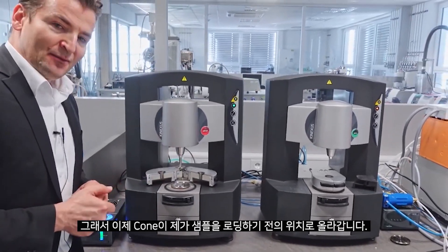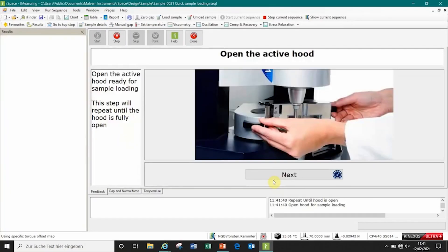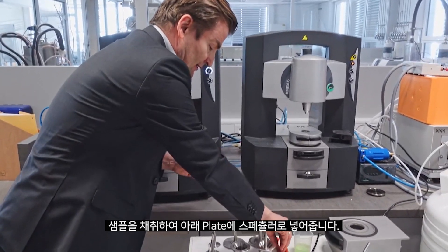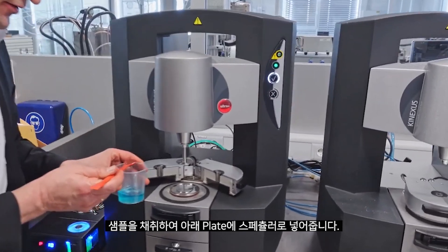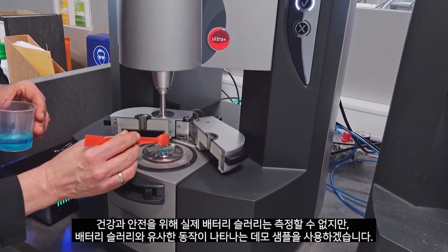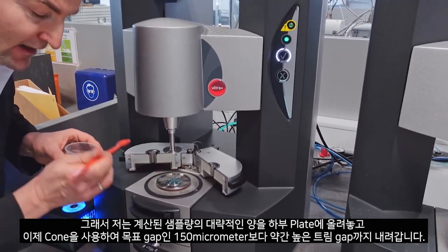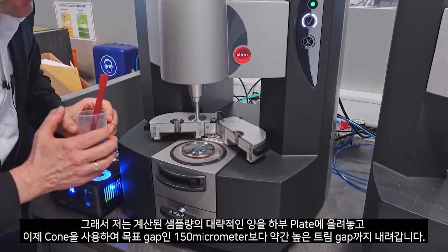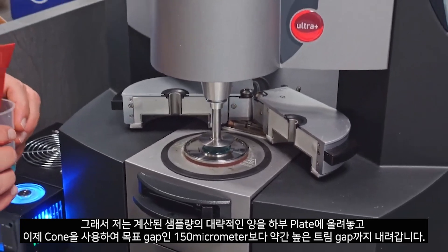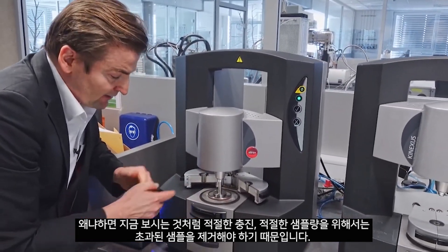The upper cone is now driving up to a loading position. Before I load the sample I will give in the sample name — I call it Slurry1 — and the software prompts you to load a defined sample volume. I take the sample and apply it with a spatula onto the lower plate. We are using a demo sample at the moment because for health and safety reasons we cannot measure real battery slurries, but it shows similar behavior.